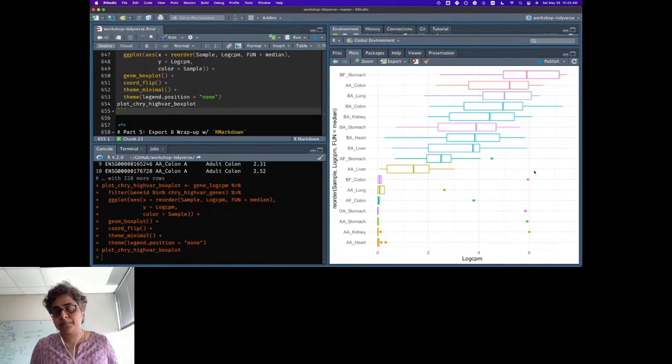Chat, please. What does this analysis, subsetting, plotting, and everything tell us about the samples? That's my question. Guesses are fine. Close guesses are fine.